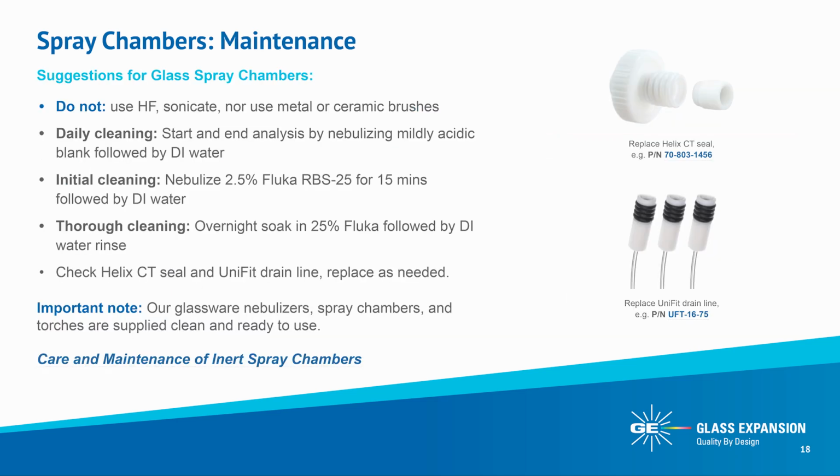Now let's discuss maintaining spray chambers. First, never use hydrofluoric acid to clean your glass or quartz spray chamber, as it can cause serious damage. Also, avoid sonication and using metal or ceramic brushes, as they can break the chamber. If you notice washout issues, poor RSDs, or droplets collecting on the chamber walls, it's time to clean.